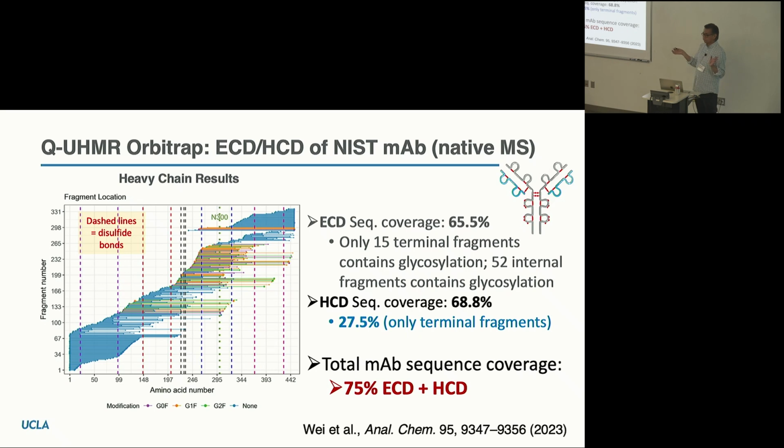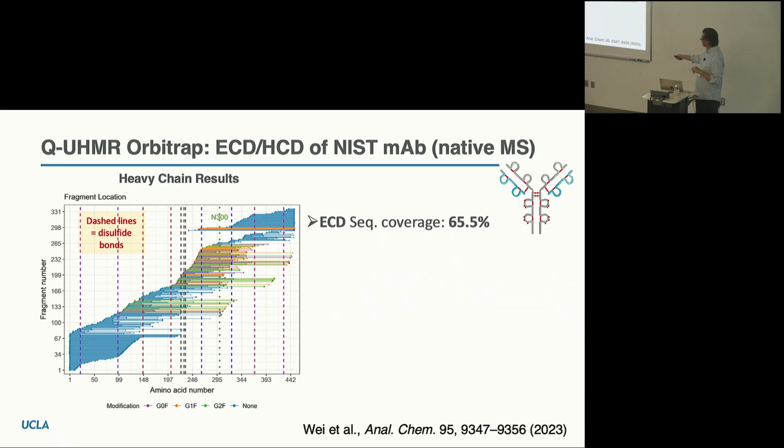Anything else? Yep. For the internal fragments, has anyone in the field done a lot of MS3 experiments at this stage to chase down where you find them? So the question is, has anybody looked at MS3 to confirm or disprove internal fragment ions? The laboratory at Michigan, now she's at Florida State, Kiki Hawkinson, they proposed to do MS3 experiments to confirm these internal fragment ions. Remember, internal fragment ions are, let me go back.